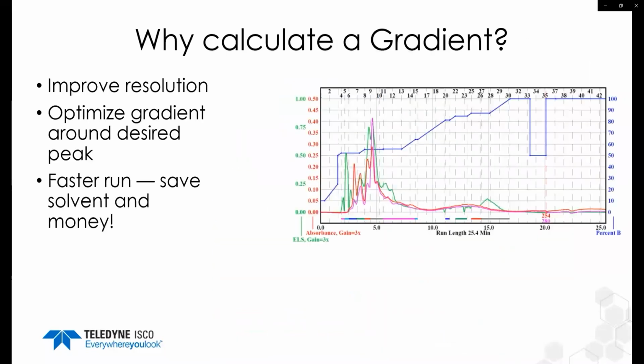Here is another example where time was wasted purifying a compound. Calculated gradients improve resolution and save time, solvent, and money.